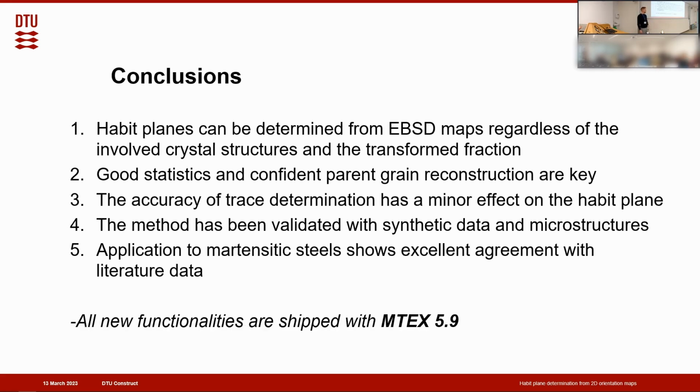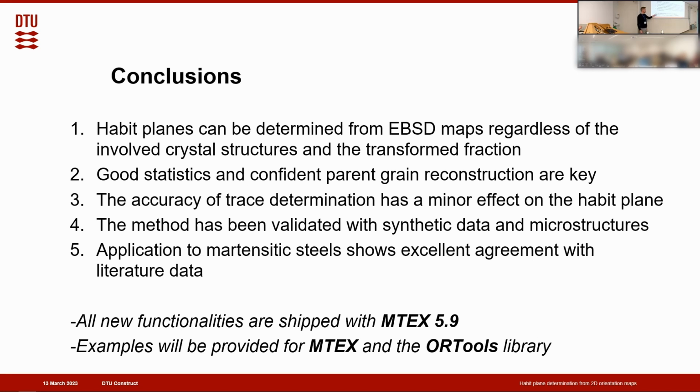So all new functionalities are shipped with MTEX 5.9, and we're also going to be posting some examples in MTEX and also a new OR tools library soon.